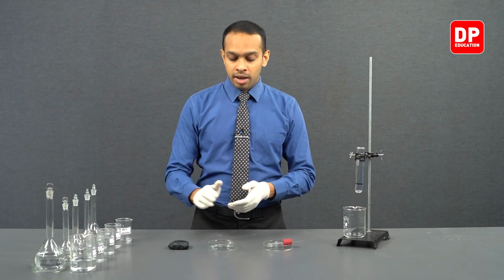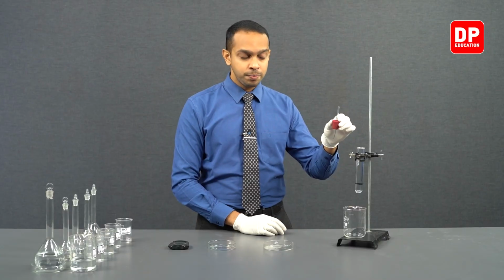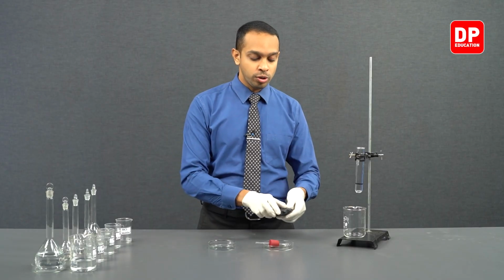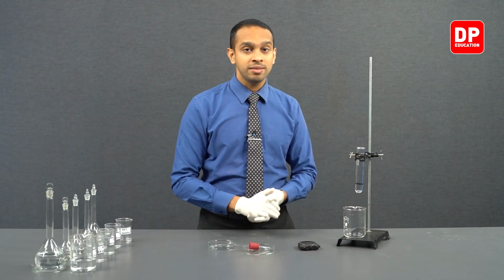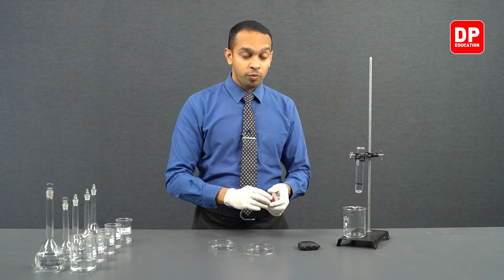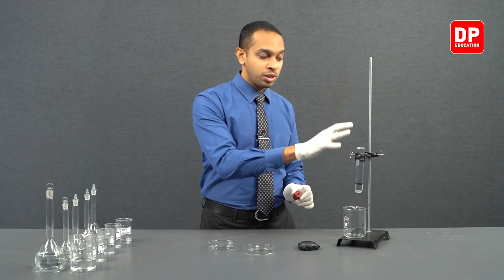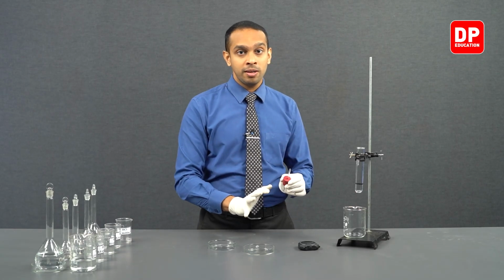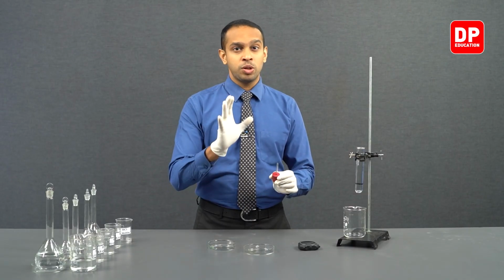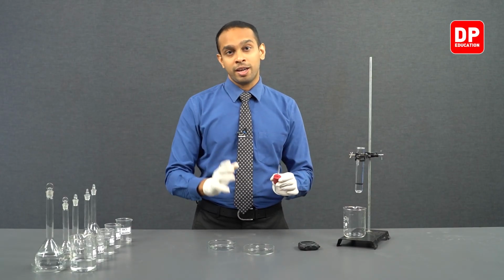Then students, as soon as you plug in the rubber stopper, we have to turn the tube upside down, and as soon as you do that, you have to turn on your stopwatch. So we will keep the stopwatch close by, so it will be easier for us to turn it on as soon as we turn it upside down. When you are doing this experiment, you have to make sure that as soon as you introduce the magnesium piece into the HCl and turn it upside down, you turn on the stopwatch. Otherwise, you will not be able to measure accurately the time that it took for the hydrogen gas to get collected all the way up to this mark.